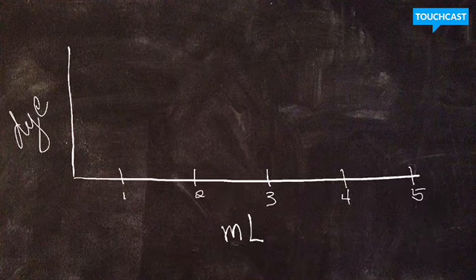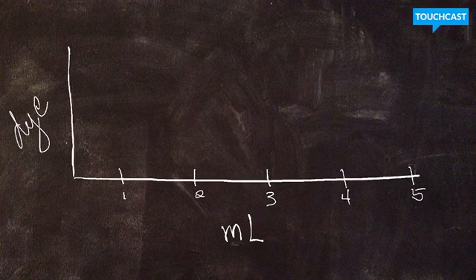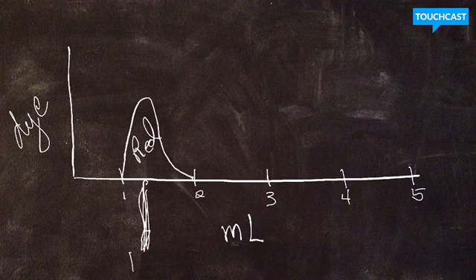Basically, the information that you just calculated is giving you kind of the effectiveness of the separation. So we started to see the red pull out at 1 milliliter, and the center of the bandwidth was about 1.4. This was the center of the bandwidth. So if I can do a good job here at drawing, we could say that maybe that first hump looked like this, and this was the red. And you can look in your lab book, right? The center of the bandwidth was about 1.4 milliliters for the red.